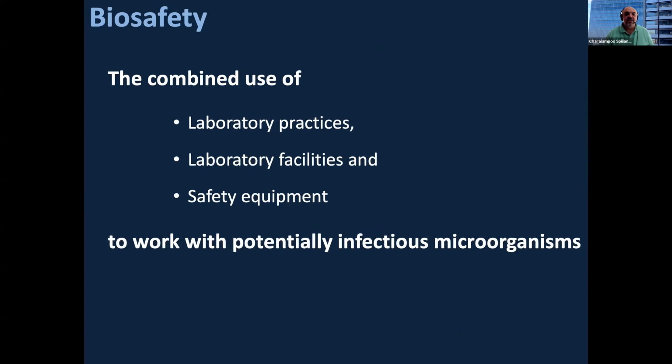Now, regarding the definitions, when we talk about biosafety, we usually refer to three things, and I'm going to follow these three things when I talk about biosafety levels 1 and 2, to which all of our laboratories at the IMBB belong. So from the beginning, I have to tell you that all IMBB laboratories are biosafety level 2. You're going to see later what I'm talking about.